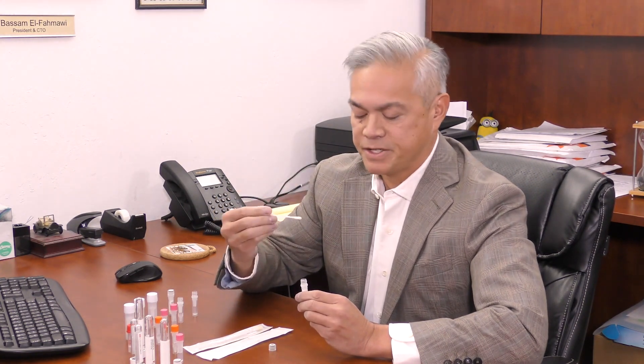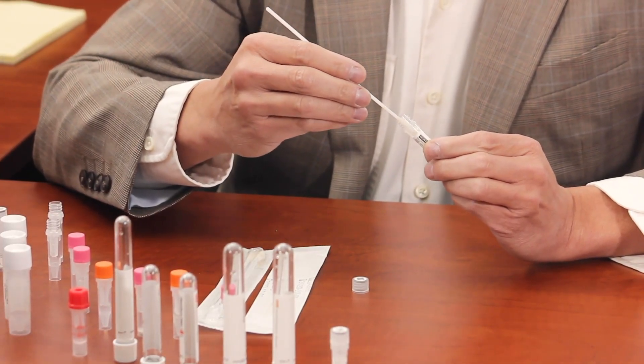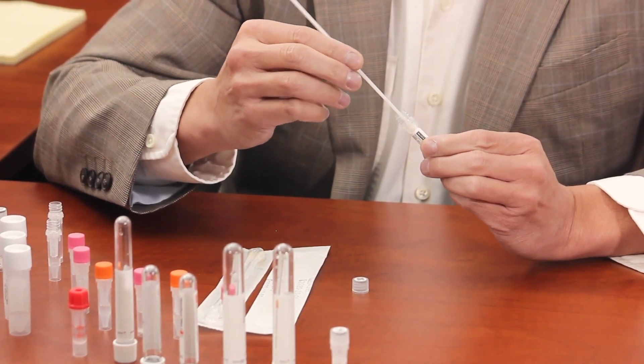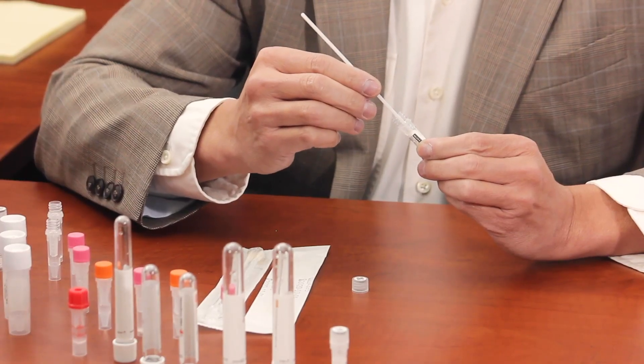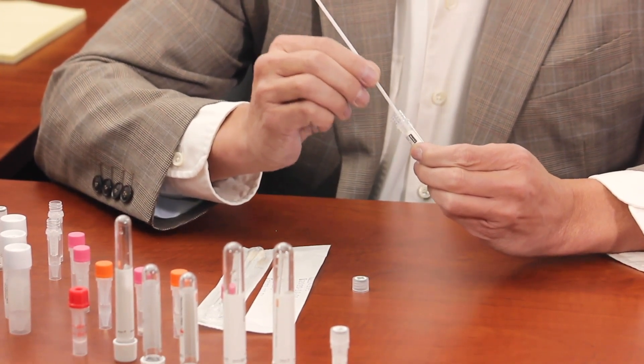After swabbing, the next step is to concentrate and collect the samples into our proprietary device. The first part is to twist the swab slowly into the tube. What this does — it allows the swab head to be exposed to the teeth of the insert, which then loosens the material that's been collected. Once the swab is inside the buffer, you want to agitate the swab up and down for about 10 to 15 seconds.